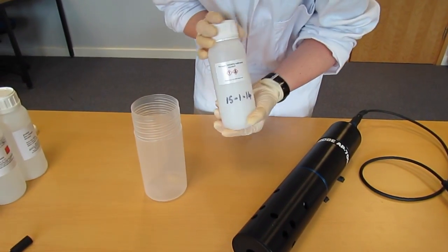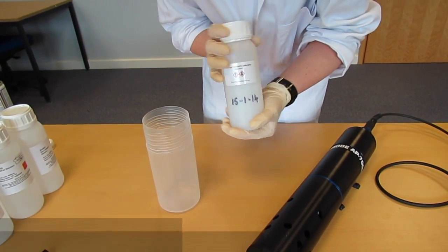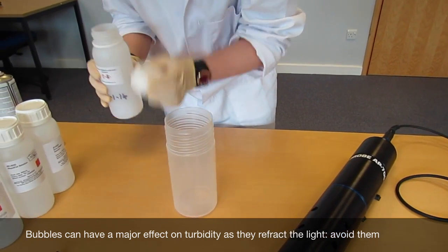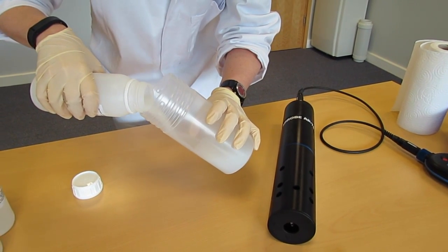Carefully invert the formazine to mix the solution together. Don't shake it as it will cause air bubbles in the solution. You need to carefully tip this into the calibration vessel so as not to incorporate any extra air bubbles.